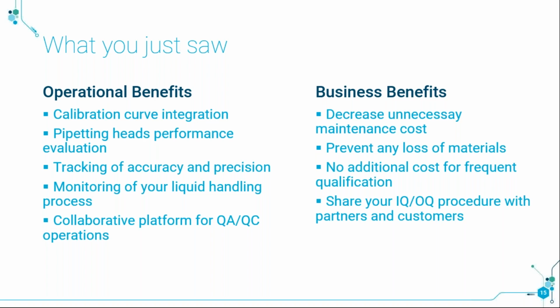It can help them manage their materials, so avoid throwing away some plates because the performance was not right. And so basically here qualification allows you to make sure that over the year you have a well working liquid handling process.